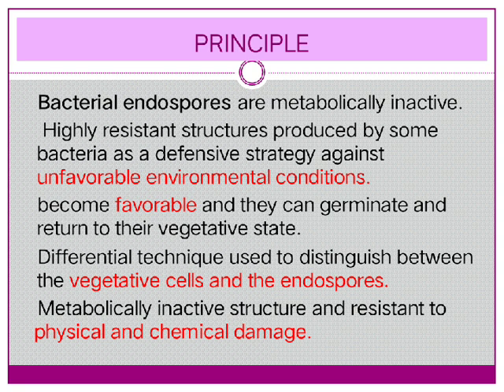Here, differential techniques are used to distinguish between the vegetative cells and the endospores. The endospore is a metabolically inactive structure and resistant to physical and chemical damage.